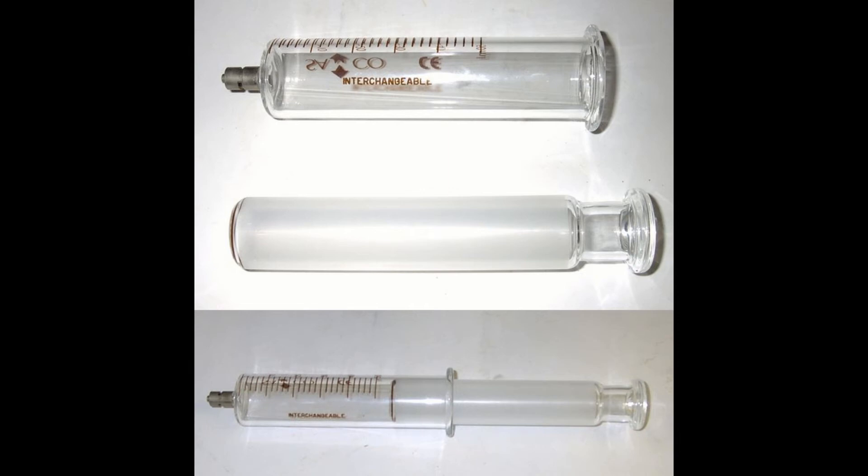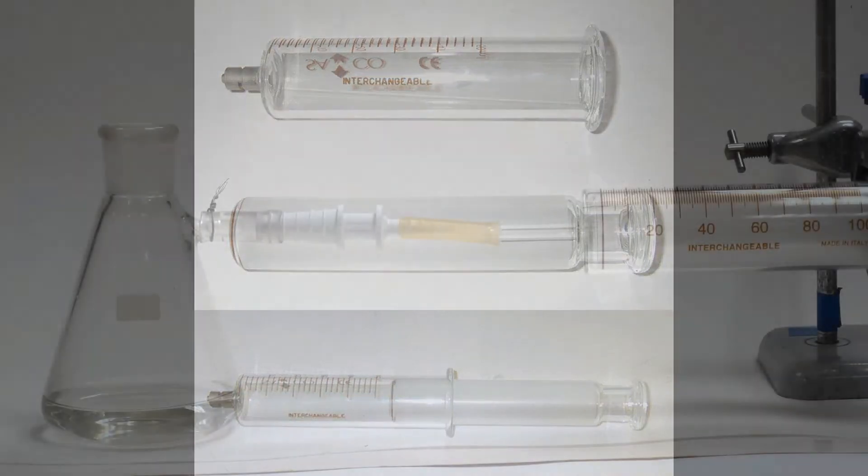It is specially designed to have very low friction in the barrel, low enough so that the plunger can easily be pushed out by the very slightest pressure of any gas.